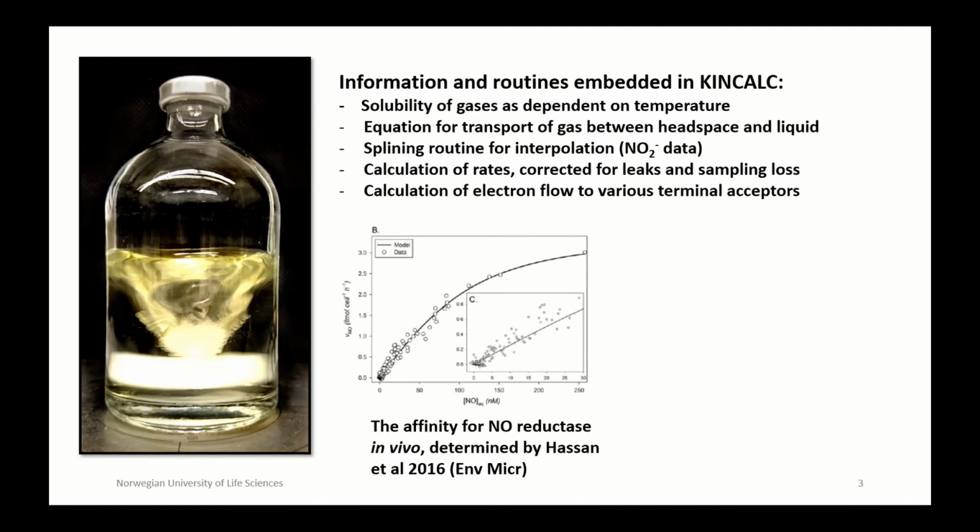These calculations are based on the information and routines embedded in KINCALC. And these are the solubility of the various gases as dependent on temperature, the equation for transport of gas between headspace and liquid, splining routines for interpolating nitrite data, which will be explained later, calculation of rates, corrected for leaks and sampling loss, and calculation of electron flows to various terminal electron acceptors.